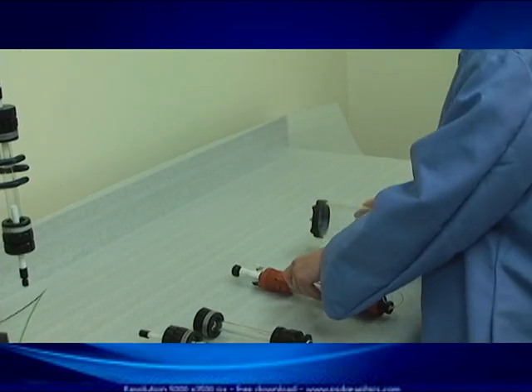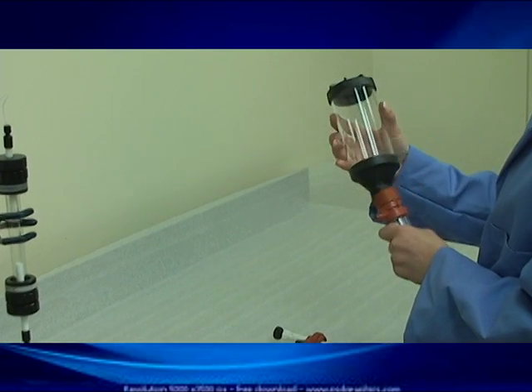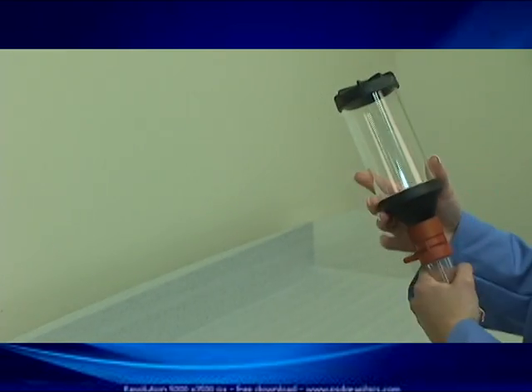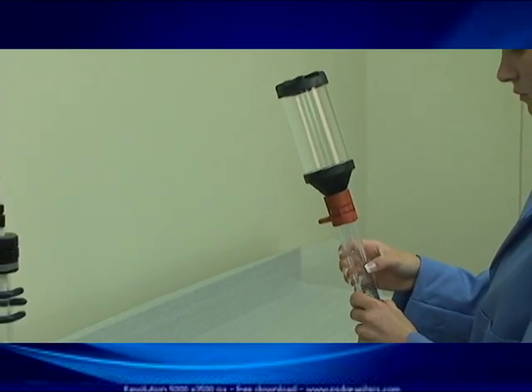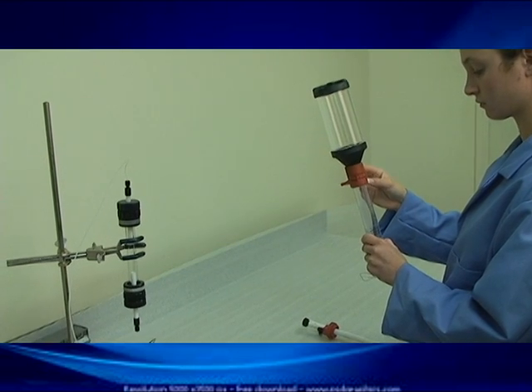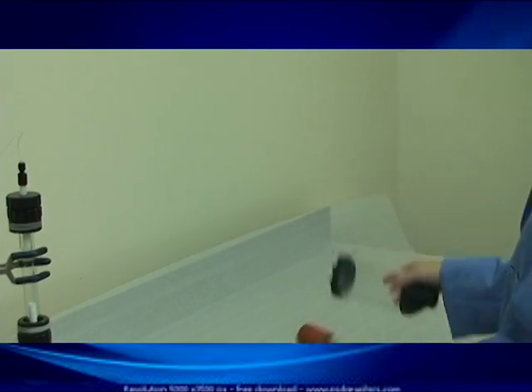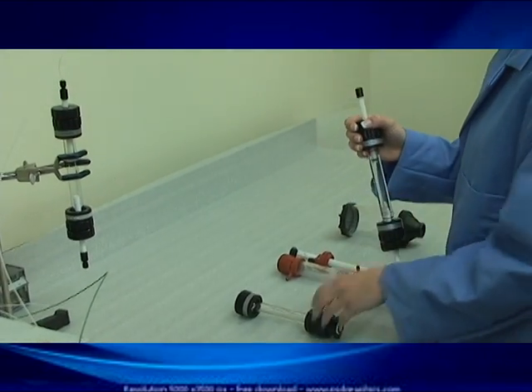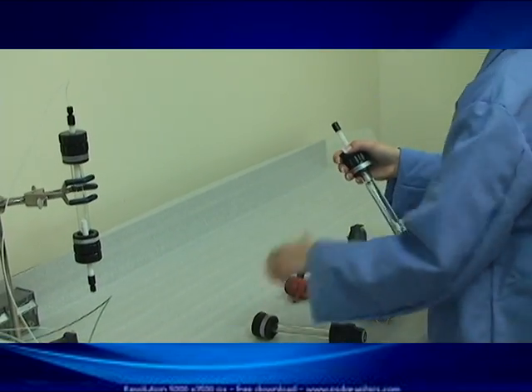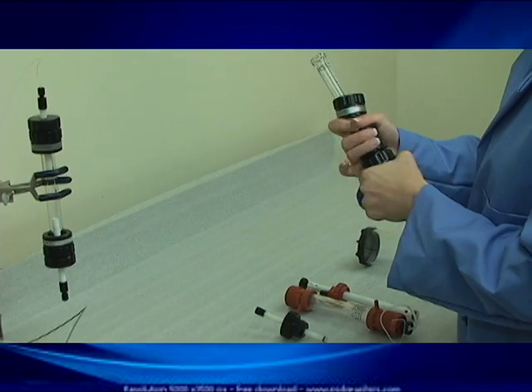The next difference is the packing adapter. The comparative packing adapter is screwed onto the end of the column and is relatively easy to install; however, its diameter is much larger than the diameter of the column. As the slurry passes into the column, there is turbulent flow which causes uneven settling of the bed — this is not the proper way to pack a column. With the ELS column, we also offer a packing adapter that is very simple to install. It is the same diameter as the column, so the resin settles evenly into the column with no diametrical difference, giving a much more uniform and evenly packed bed.